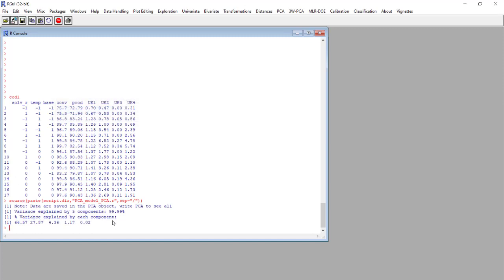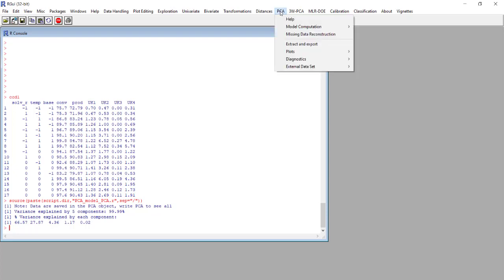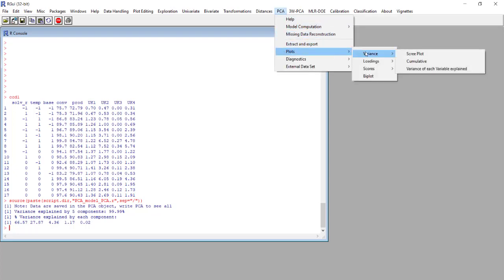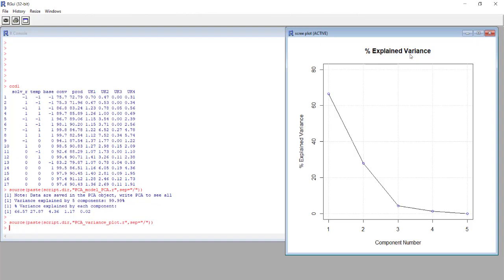This way we obtain the variance explained by each component expressed as percentage. Here we have the value for the five components and we can have the same information in the form of a plot using again the tab PCA plots and variance. We select the scree plot and as you can see we have the first component at 66%, the second component at 28%.